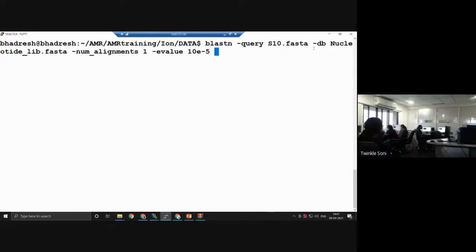Okay, so next thing that I want is percent identity. I hope like we know about percent identity. What exactly happens is when you have a query sequence and a subject, like whatever, like I try to match my hand with another of my hand. So what will happen? Some of, like, this hand might match with this or may not match with this, but there should be a limited percentage. Like I want 95% identity, I want 30% identity, I want 50% identity, or what kind of identity do I want? Basically, percent identity in our case is set to be 95%.